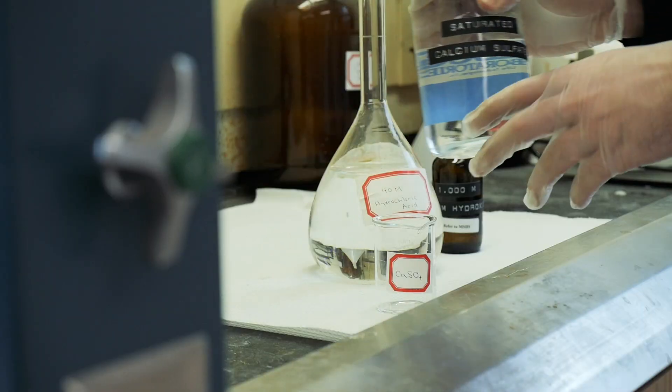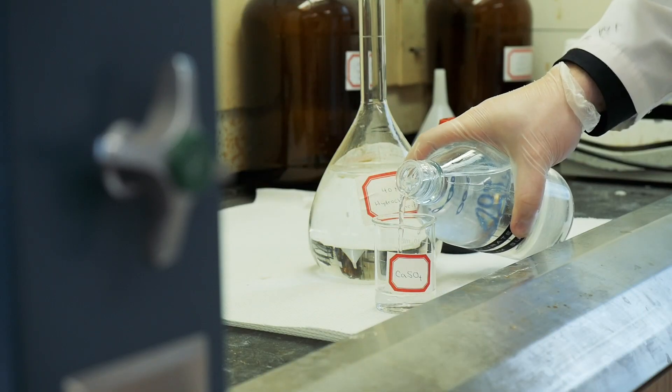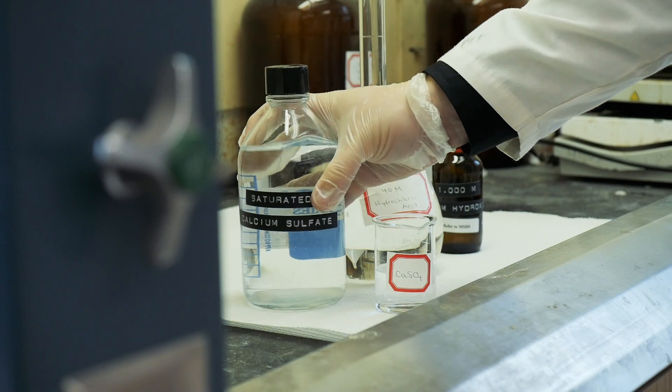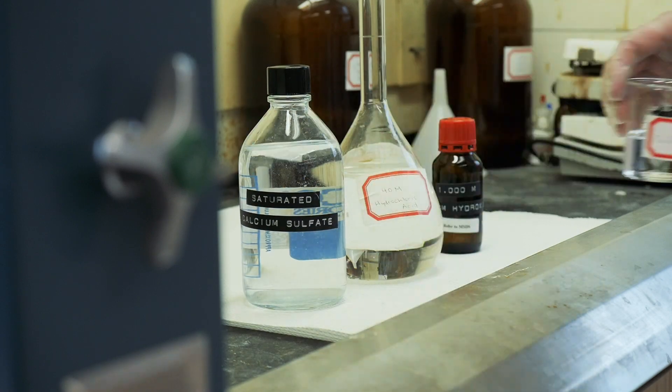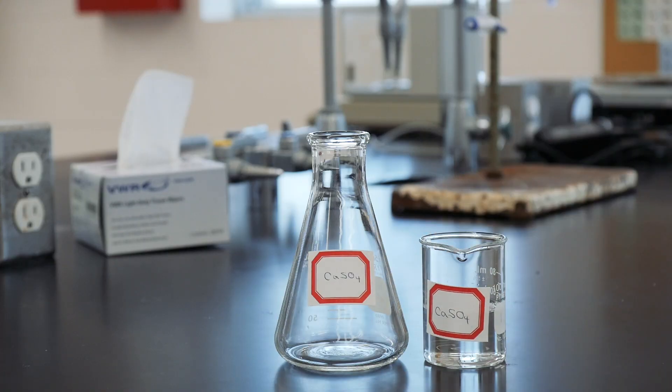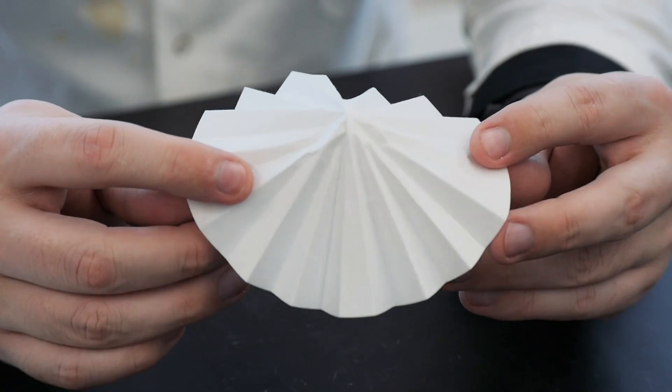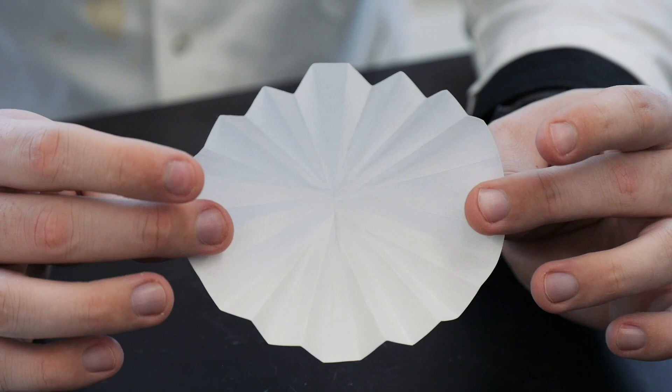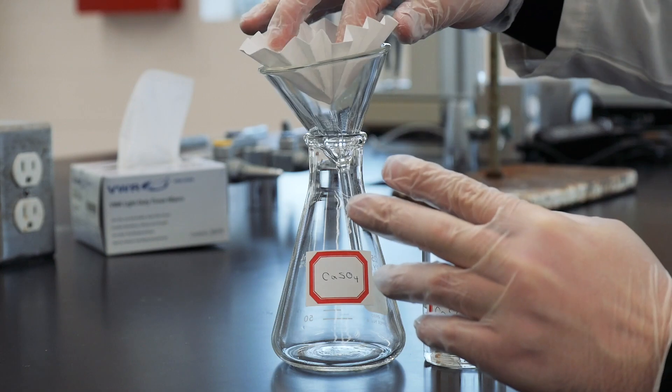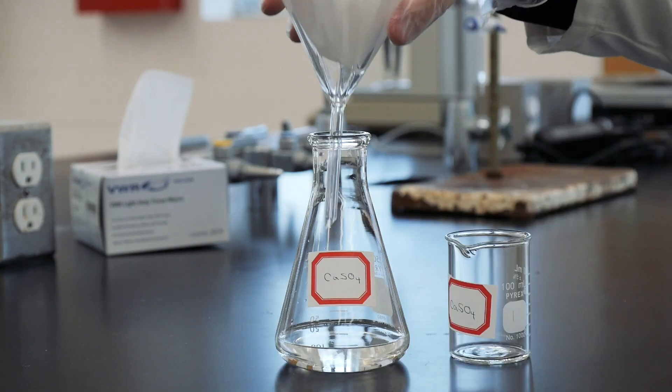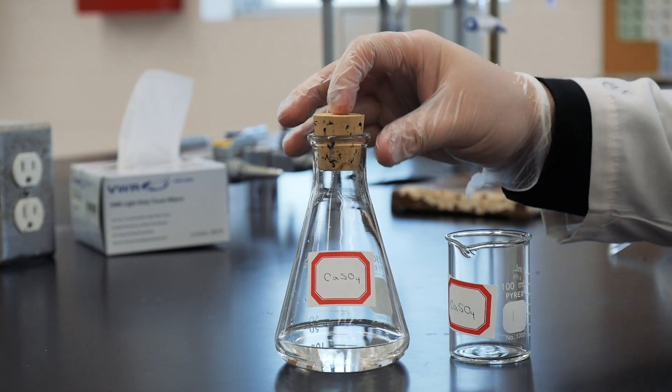A saturated solution of calcium sulfate is available for you in the lab. Collect about 50 mils of it in a clean, dry 100 mil beaker. Then filter the calcium sulfate solution into a 250 mil Erlenmeyer flask using fluted filter paper, which you can make like this. Now just stopper the flask.